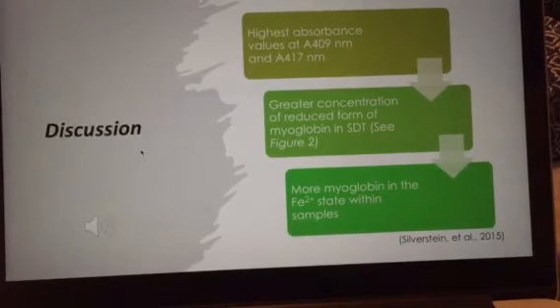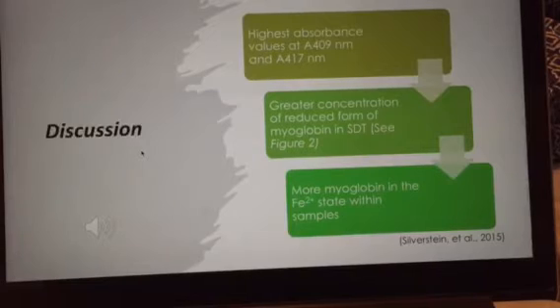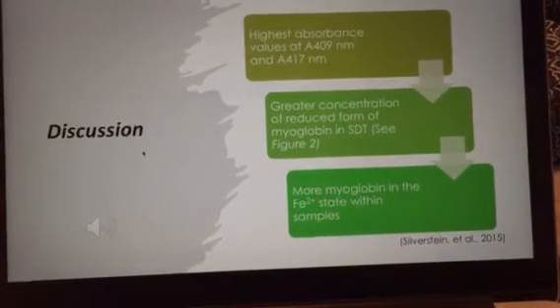And sodium dithionite acted as the reducing agent, and that correlates to its highest peak, which was at 417 nanometers, and the past research supports our findings.